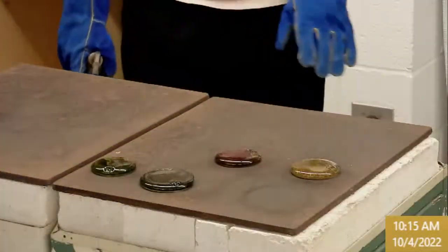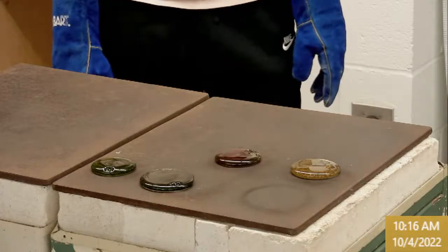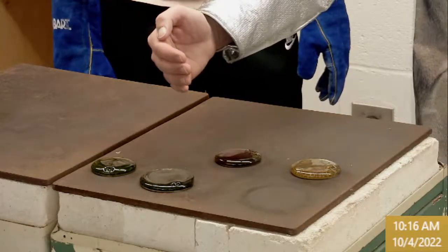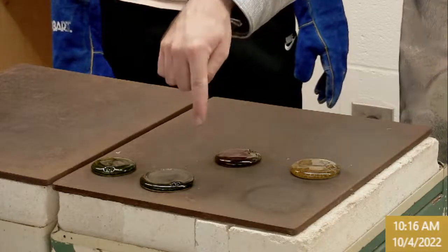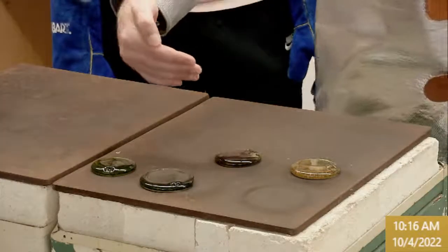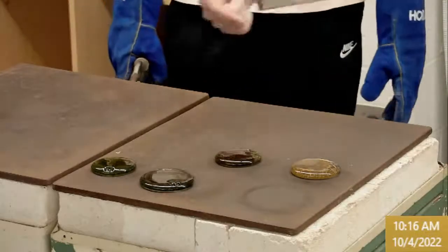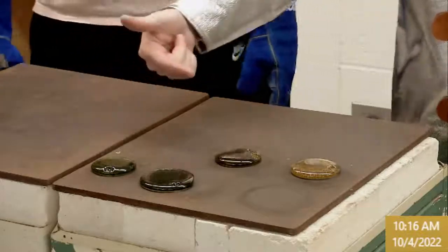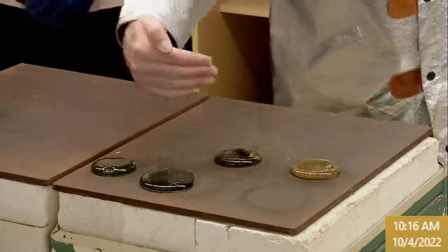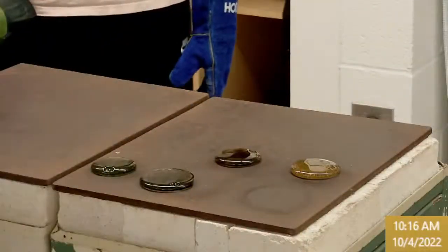So this is an exciting day here. We'll put those pieces there. That was probably due to some extra heat from the torch. It heated up that side more than the other side, and that caused it to spall off. So we'll try to angle that. If you can take this and just tilt it, you can angle your flame so that you're always shooting either parallel or in this direction. So, my bad.